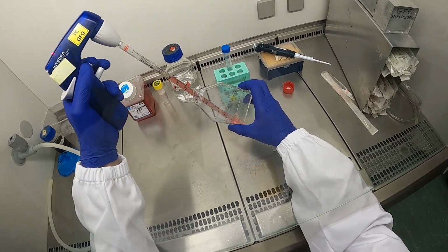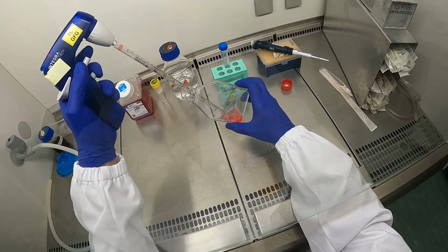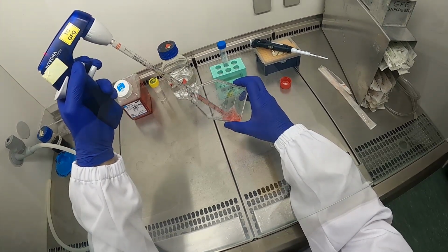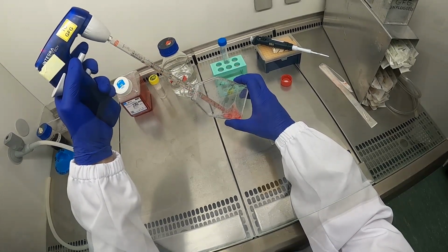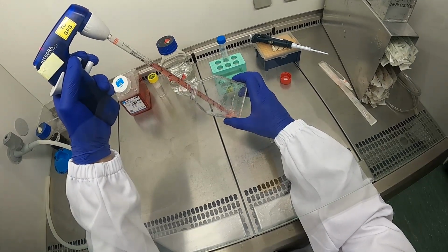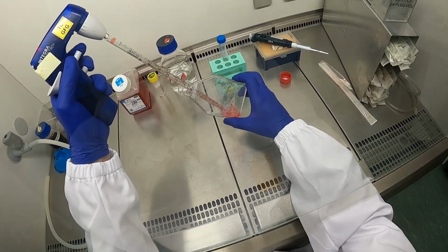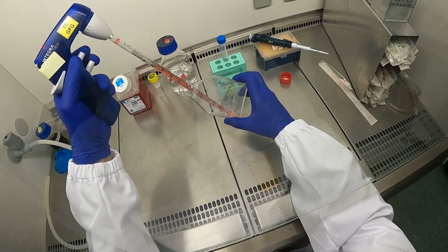So by pipetting it up and down like you're doing now, you really disrupt these clusters of cells, and you slowly start to create a very nice suspension of single cells. And because you used 10 ml, you're ending up with all the cells in that volume.